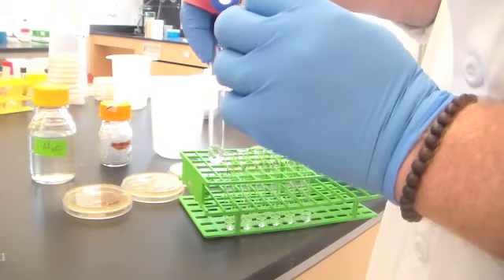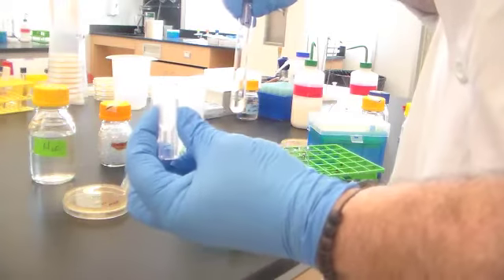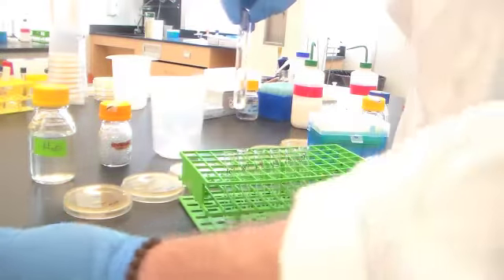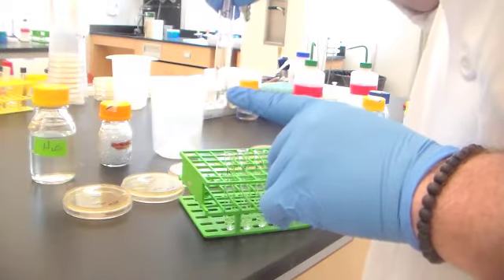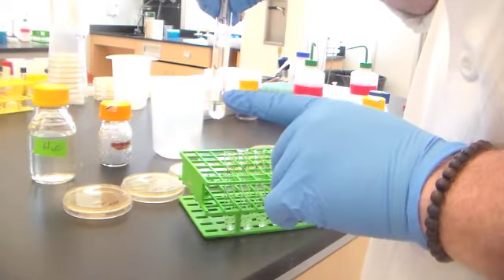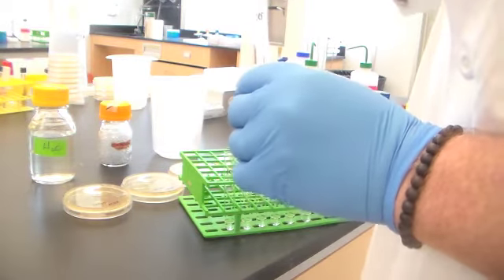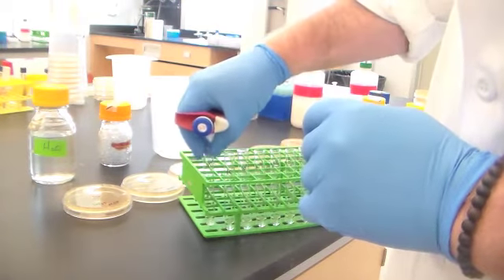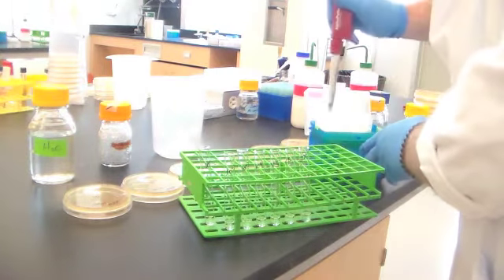Think about, visualize what you're doing. If, let's say for instance, there were 10 million bacteria per milliliter in that starting culture, and there are not, but if there were 10 million bacteria per mil in the starting culture, there are now 1 million per mil in this tube. It's a 1 to 10, or 10 to the minus 1, dilution. I've gotten rid of that pipette tip. Now, my way to make sure I don't confuse myself is I'm setting that back into a different row, because now I want to put on a new pipette tip.